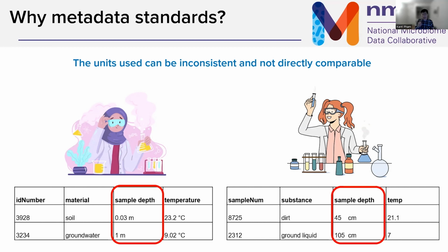So if you're not paying attention to the actual units being used here, you might end up making a mistake when doing your analysis and overinflate some numbers because you left one in centimeters, another one in meters. Big no-no, and something that you need to catch early on, or it might make it throughout the analysis.